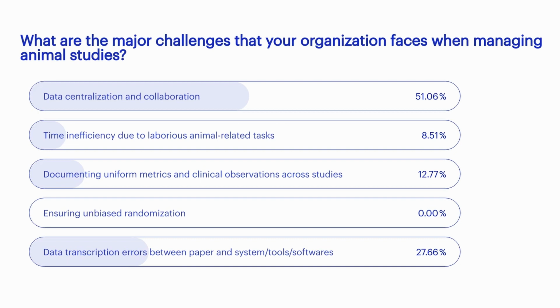So it looks like data centralization and collaboration is going to be the clear winner, but we'll let it run for another 10 seconds or so.